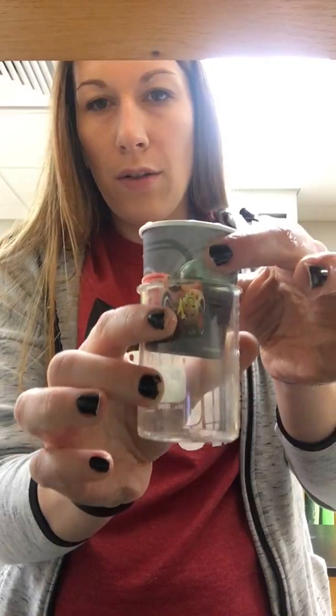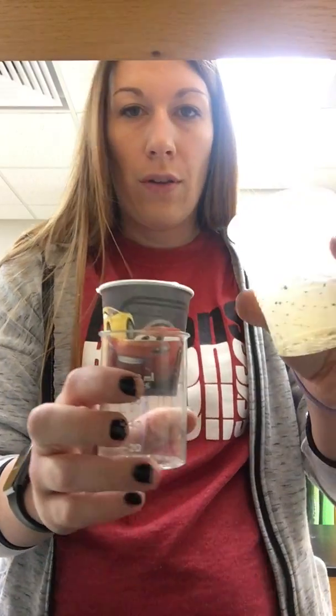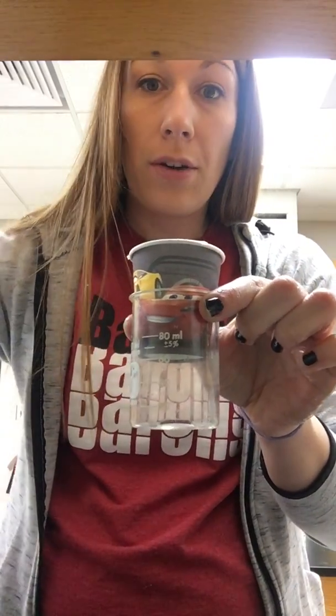So we have gravel, sand, gravel. We'll put it right over top of the small hundred milliliter beaker where you're able to hold it up. Then you would just pour your foul water down the top and it should make its way all the way through, dripping really slowly into your beaker.